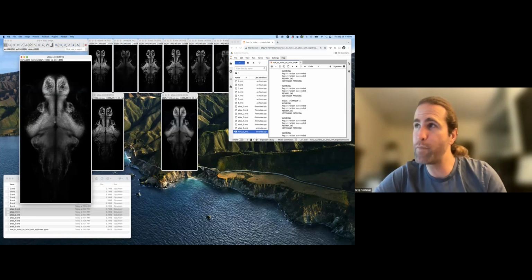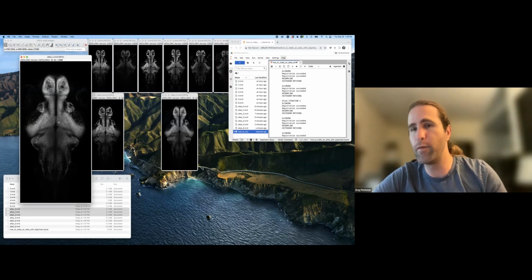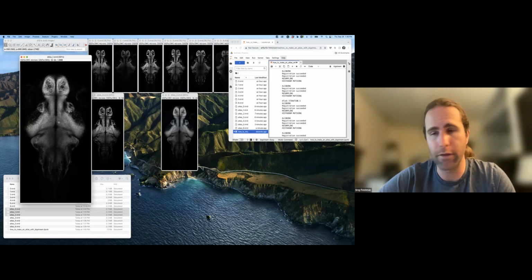So even if those boundaries are all correctly aligned, individual cells are never going to be in the same spot from subject to subject. They're different brains. They've developed along different trajectories. So individual cells are often not going to be in exactly the same spot.